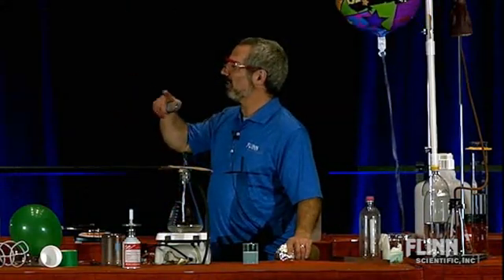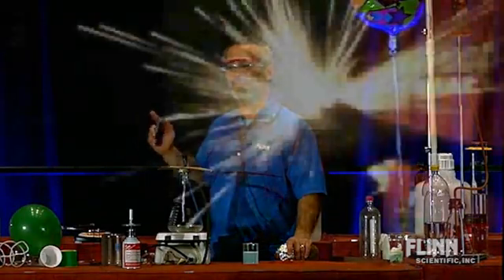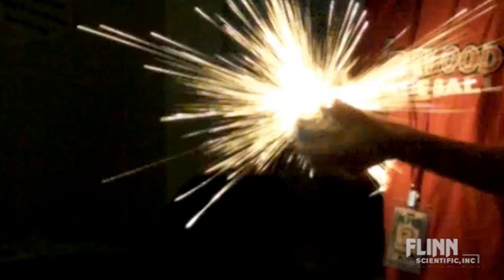Get the lights down for this. This actually shows successive images from that video. It shows up better on film because I think the camera was sensitive to infrared light. Was the student doing it there? That's one frame. There's one frame. The next one. Look at this one. I love that transition.